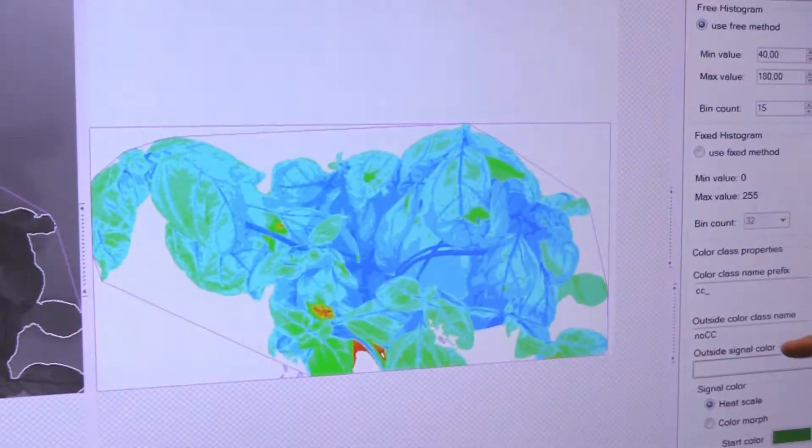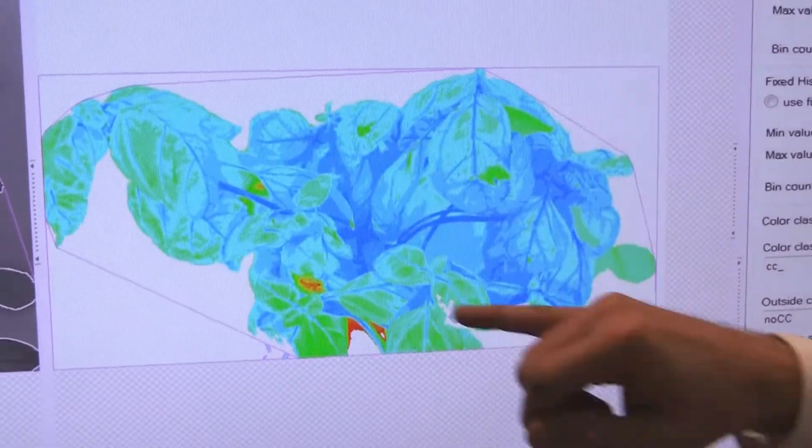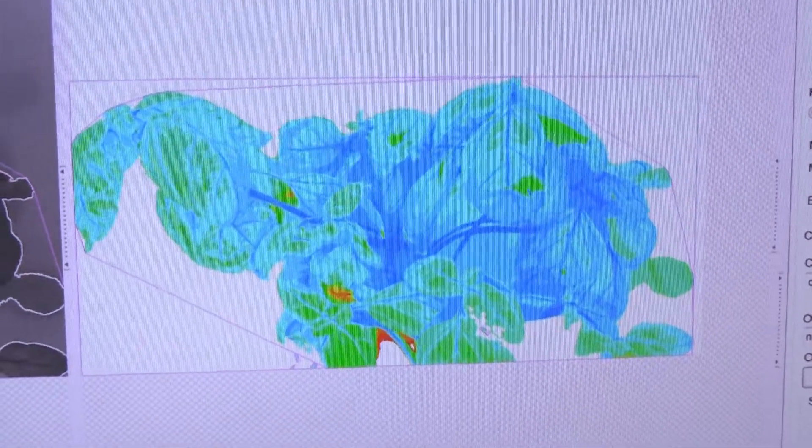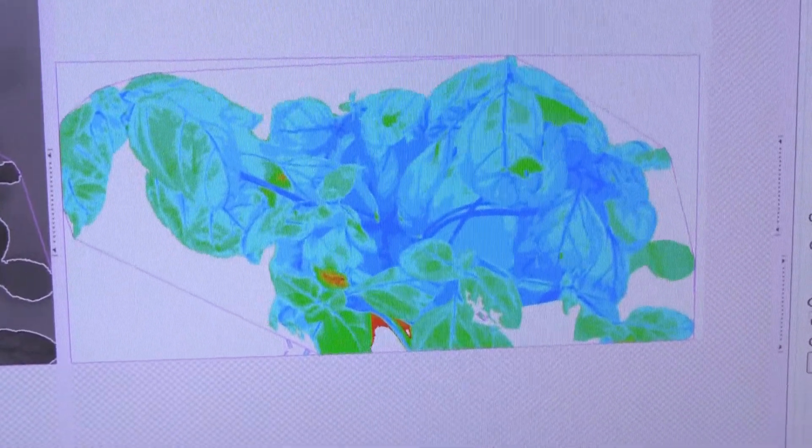We have here a processed image. You can see a classified image by color, and the red areas show the dry areas.